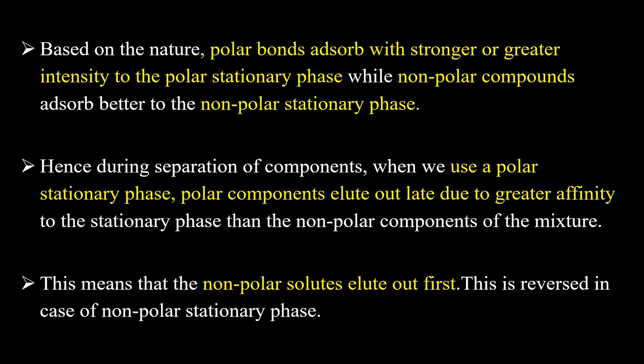Based on the nature, polar compounds adsorb with stronger or greater intensity to the polar stationary phase, while nonpolar compounds adsorb better to the nonpolar stationary phase. Means polar bonds are formed with the polar stationary phase, whereas nonpolar compounds adsorb better on the nonpolar stationary phase.